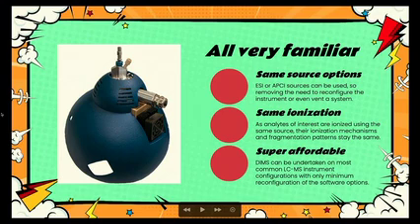There'll be maybe just some small configuration changes in the software, nothing of any real consequence, which makes it very easy to switch between doing direct injection, running through maybe 1,000 samples over the course of a day or a couple of days, and then, when you've got a list of samples that you want to focus on in more detail, changing the software settings and focusing on the 20 or 30 samples that you're most interested in, and going back to doing your LCMS analysis on them.